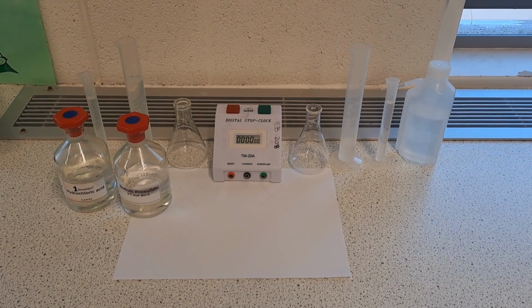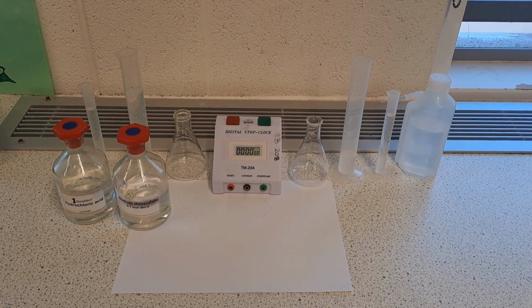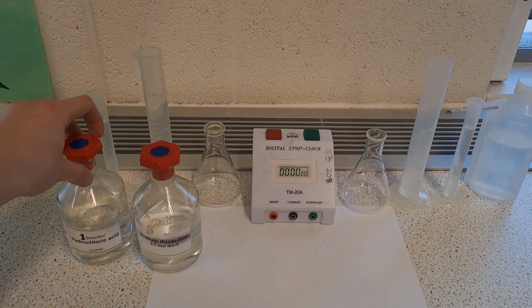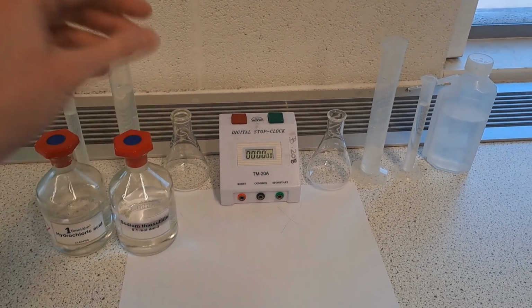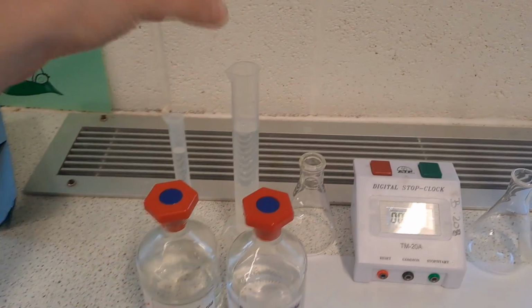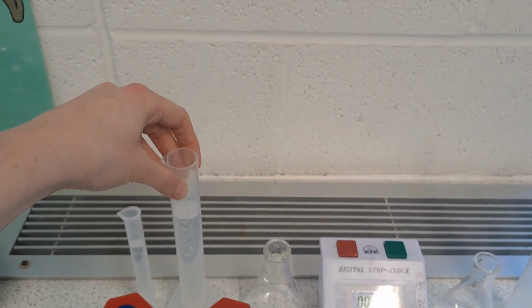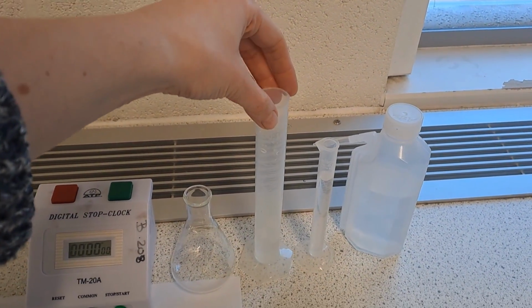In this example, I'm only going to test 2 concentrations of sodium thiosulfate, although ordinarily you might make up maybe 5 different concentrations to test, but I don't have that many hands. So you can see here I've got my hydrochloric acid and sodium thiosulfate. You aren't supposed to remember the names of those chemicals, but realistically that's what the question is likely to be about. And so I need to start off by making my different concentrations. So you can see here I've got 50 centimetres cubed of sodium thiosulfate in the measuring cylinder, and then over on this side I've only got 10 centimetres cubed.